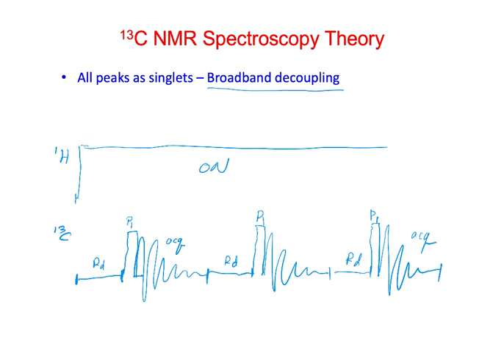And so this has a couple of effects. One is that it decouples the interaction between the protons and the carbons. So it removes the splitting for the carbon-hydrogen bonds.